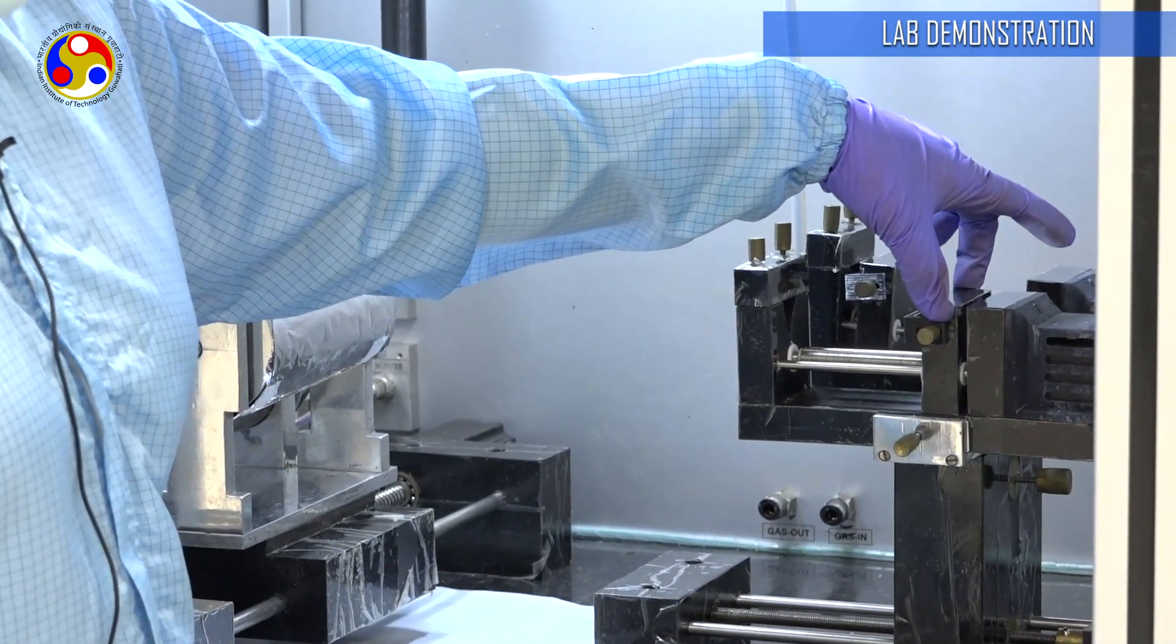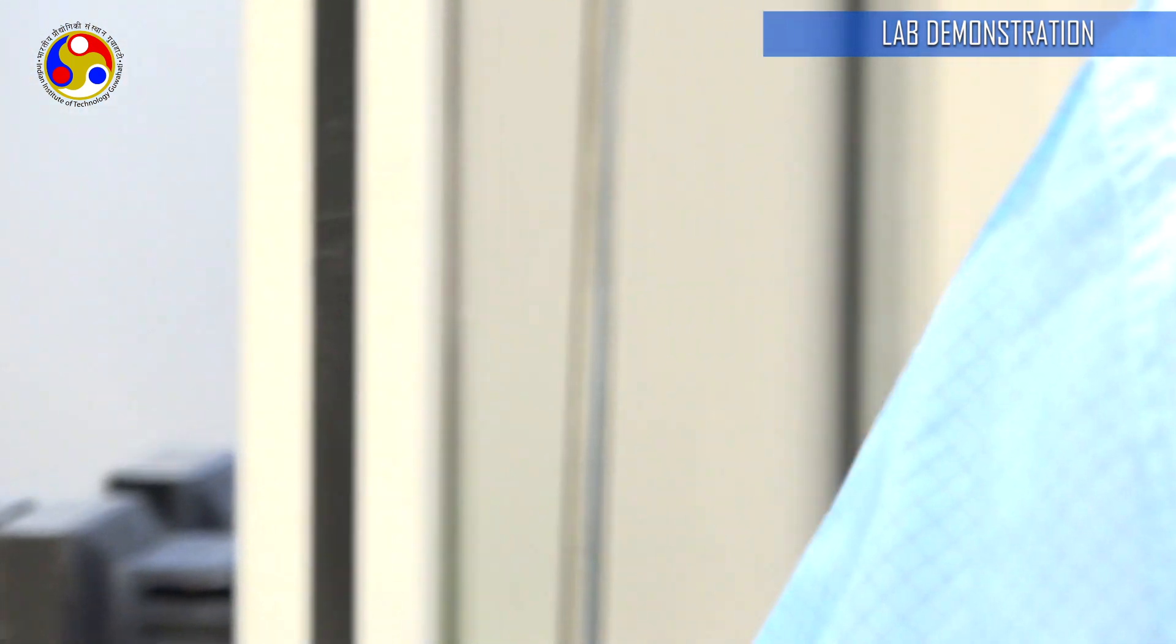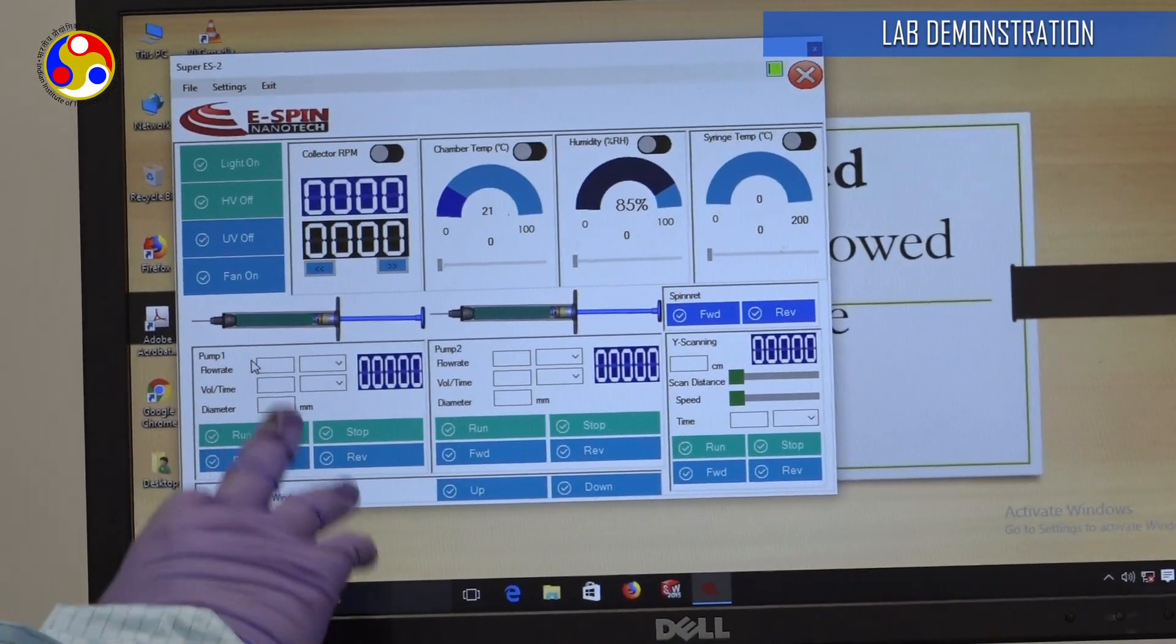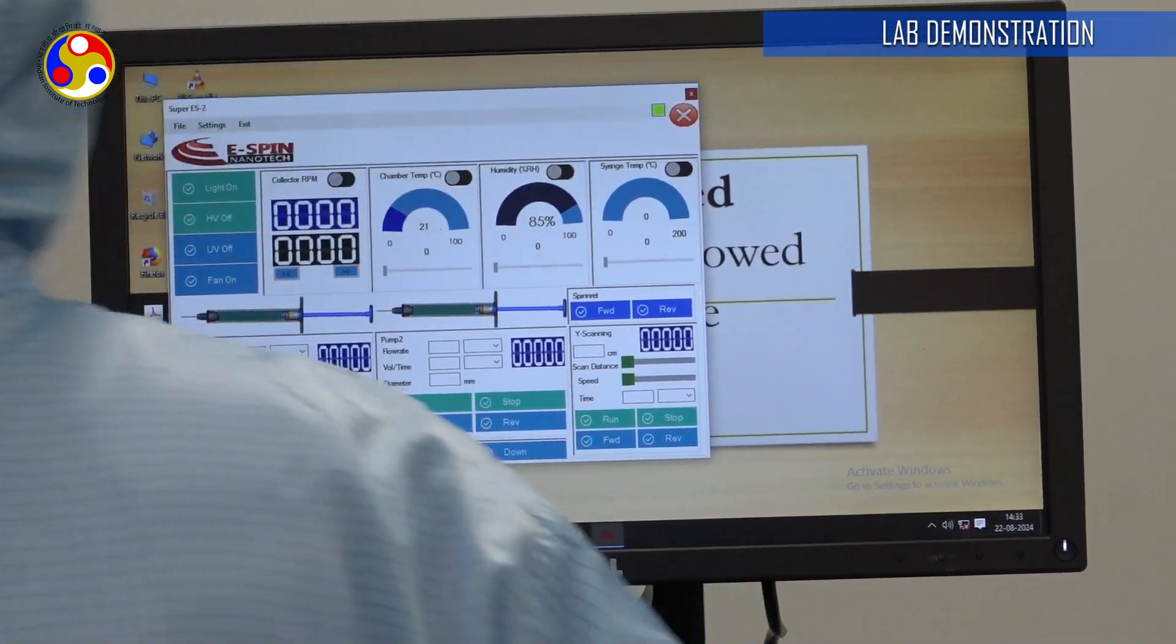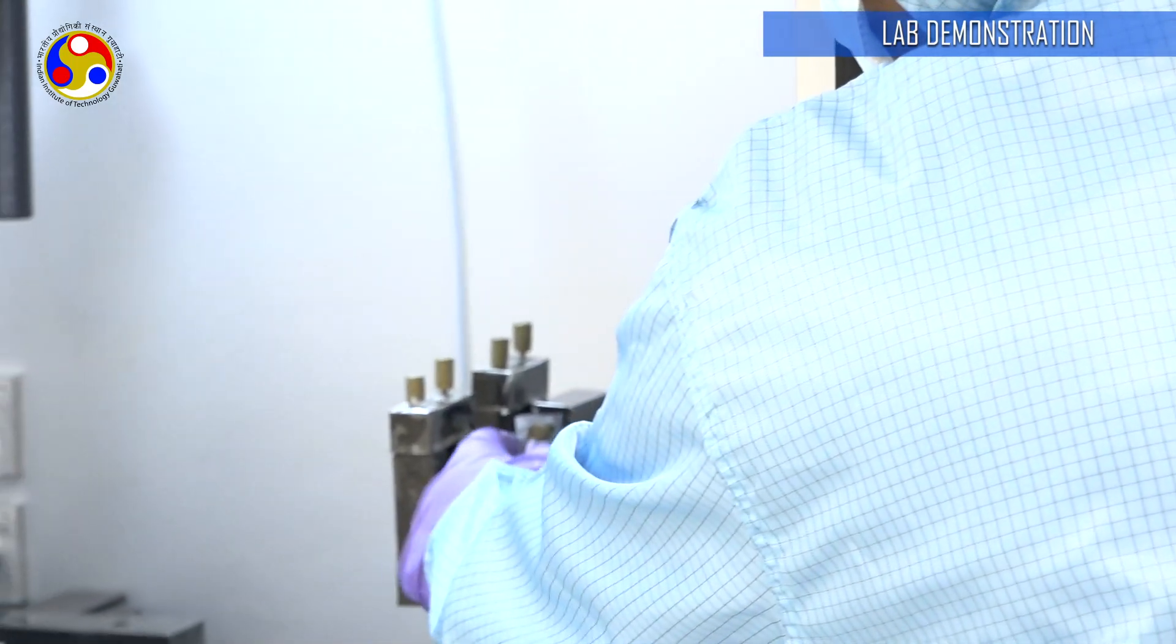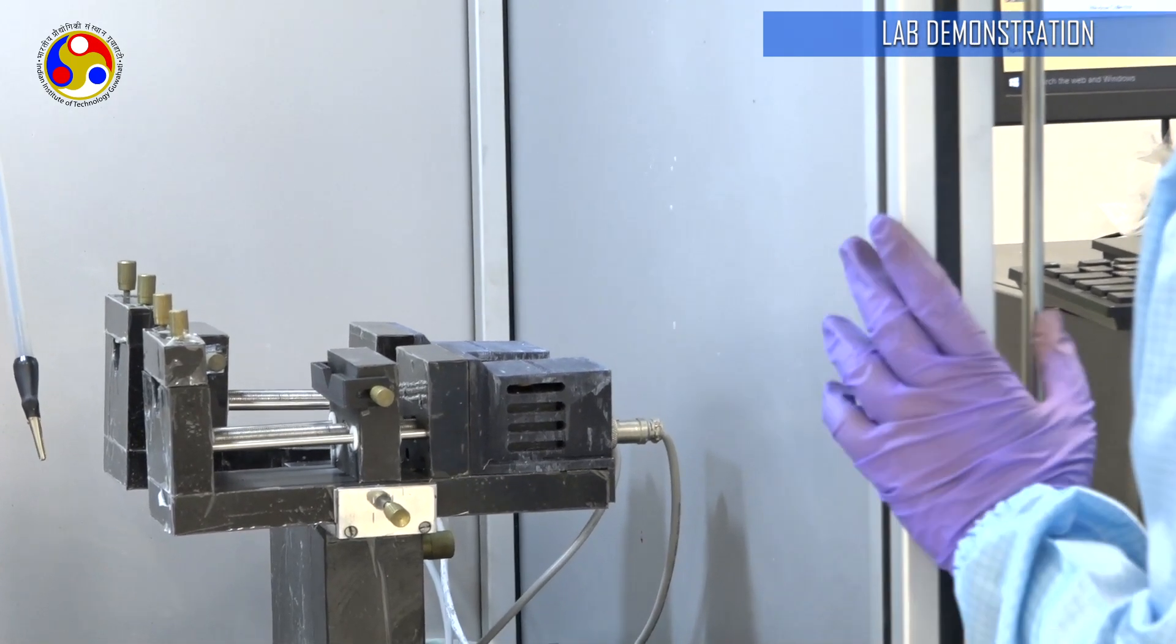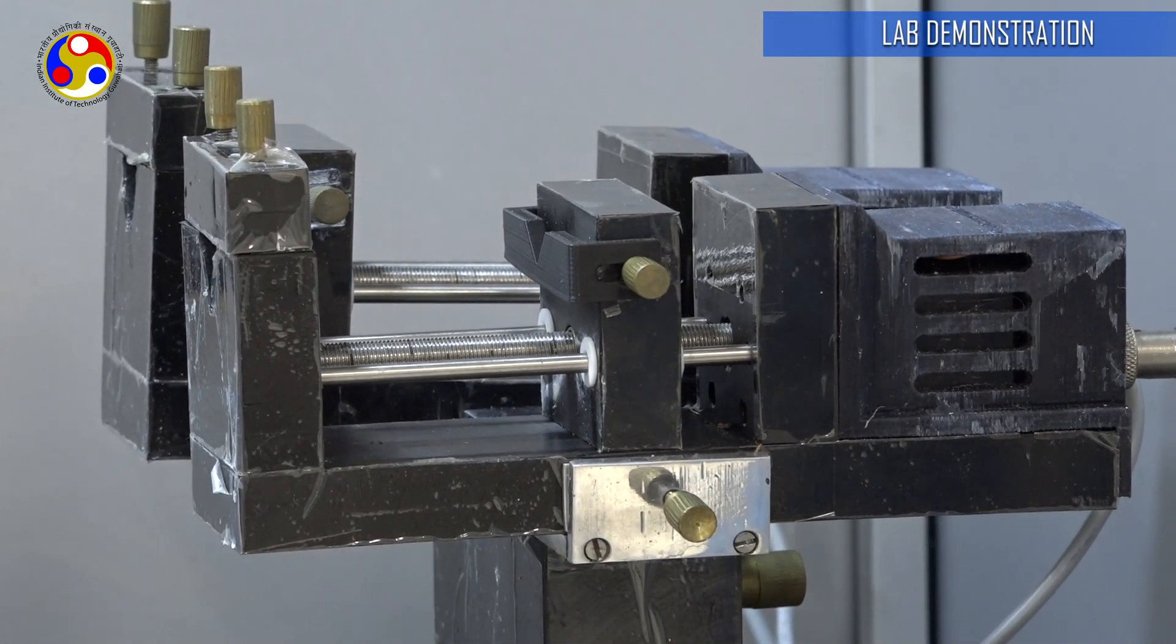This part here acts as the piston of the syringe pump and it will push the piston of the syringe forward or backward. I am going to use the software. This one is pump 1 and this one is pump 2. I will use the pump 1 interface to control the movement of this piston. First, I am going to push it forward a little bit. We can see the screw moving. This piston is moving forward. Now, let's load the syringe.